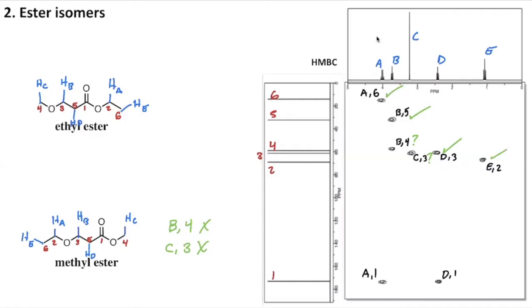If we look down here at the bottom for A1, we want to take hydrogen A and see if we can get to carbon 1 within 3. So we go 1, 2 over the oxygen, and 3 to get to carbon 1. Now on the bottom, if we start at A, come down, there's 1, 2, 3, 4, 5. So that's not close enough. It seems that that one won't work out either. Let's erase those annotations and say that the A1 here, also not good.